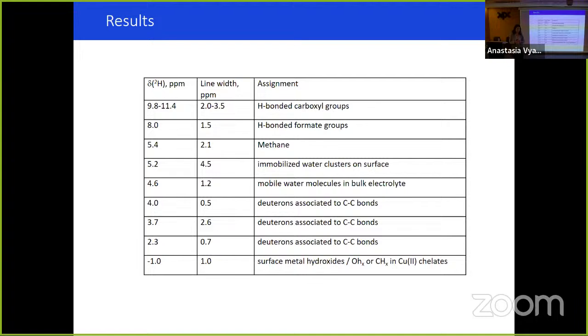Thanks a lot for the talk. It was very nice. I was very curious about the second side, the electrochemistry. I think it's really powerful that you can actually look at the products and the copper. And I wanted to ask about the copper. Were you able to see some reduction, starting with oxide and then following the amount of oxide and metal with this technique?